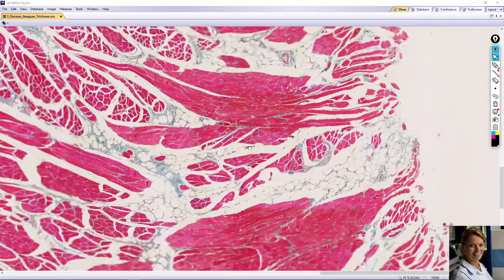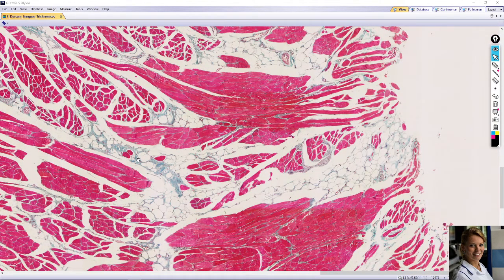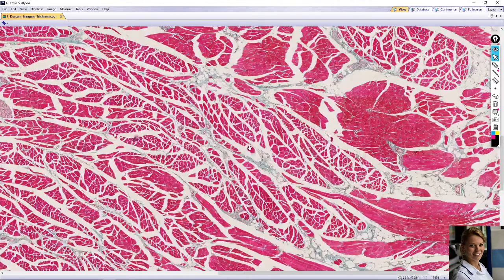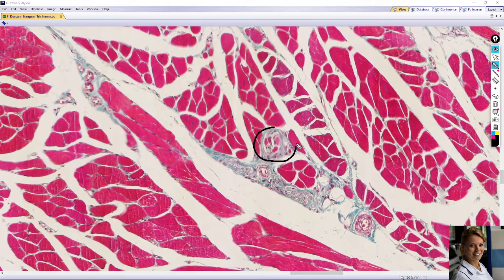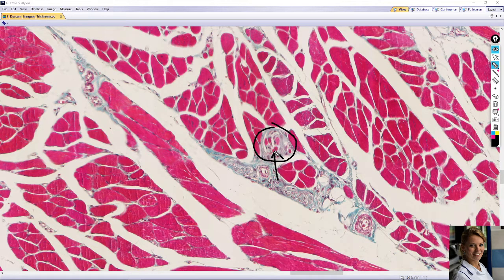This slide shows a very well-visible muscle spindle. This is a sensory stretch receptor. The specialized muscle fibers are located in the spindle and surrounded by a capsule — here is the capsule — made of collagen fibers. The muscle fibers inside are called intrafusal fibers, located in the center of the muscle spindle.